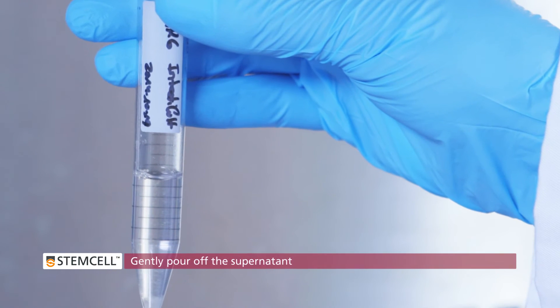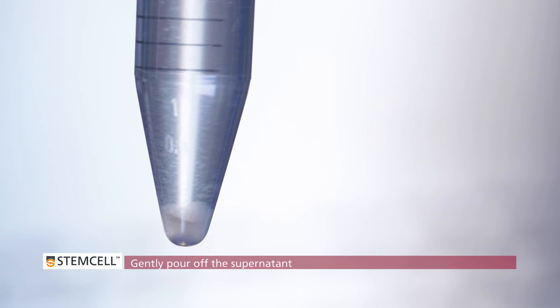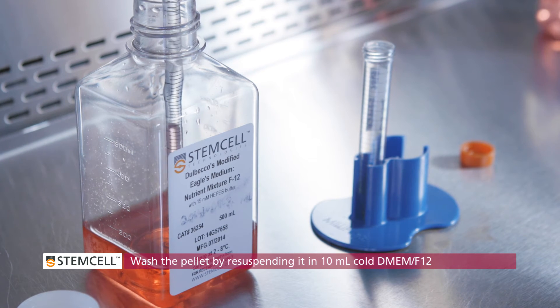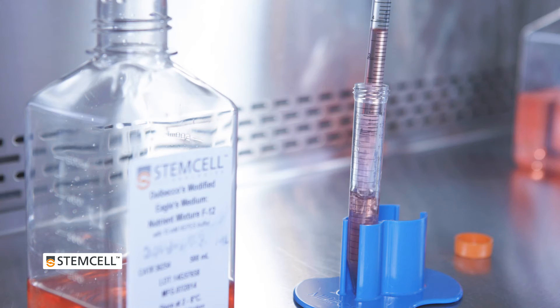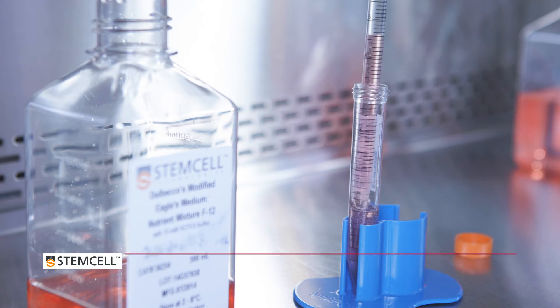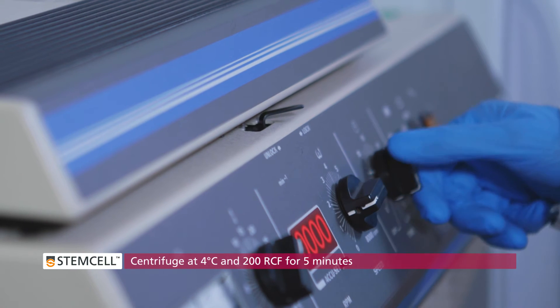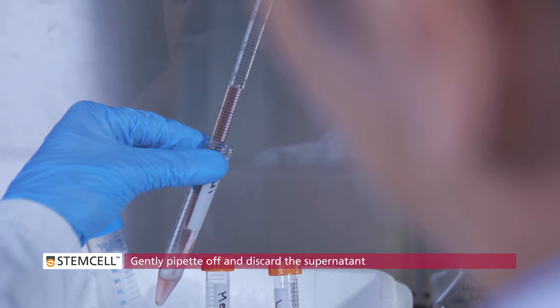Centrifuge the tube at 4 degrees Celsius and 290 RCF for 5 minutes. After centrifugation, gently pour off the supernatant leaving the pellet in the tube. Wash the pellet by re-suspending it in 10 milliliters of cold DMEM F12 using a pre-wetted 10 milliliter serological pipette. Centrifuge at 4 degrees Celsius and 200 RCF for 5 minutes. Gently pipette off and discard the supernatant.